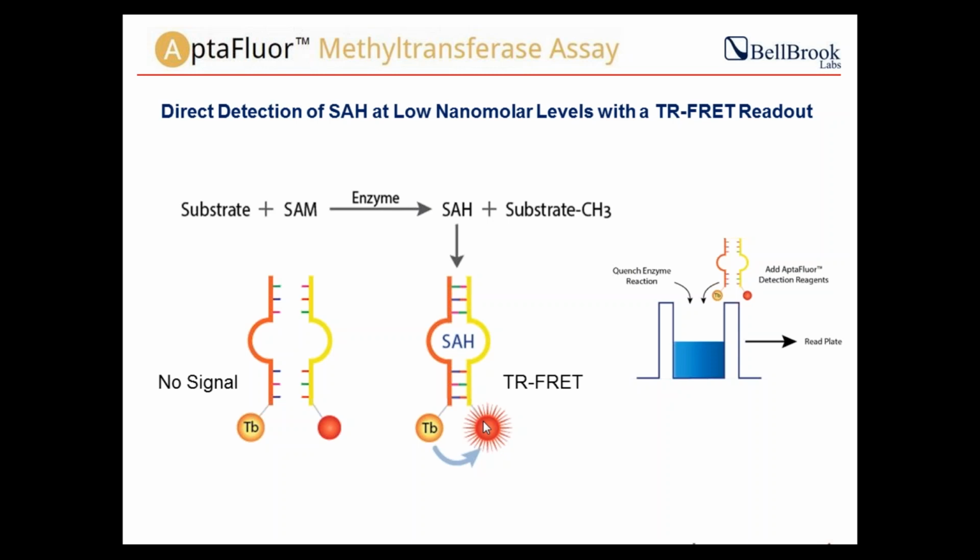However, if you're running it in kinetic mode, and if you have a standard curve, you can start monitoring the signal anywhere from 30 minutes onwards. And if you have a standard curve that's run at 30 minutes, you can go back and interpolate your data. So definitely that is possible.